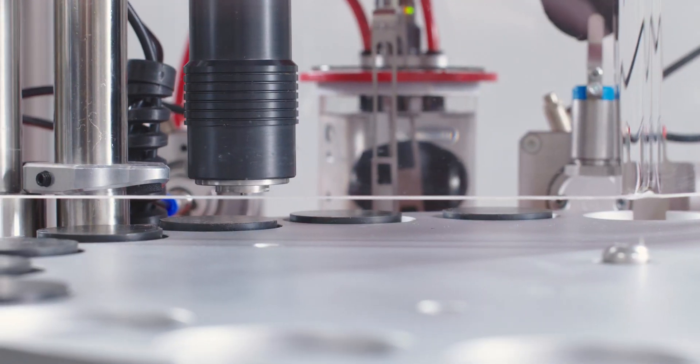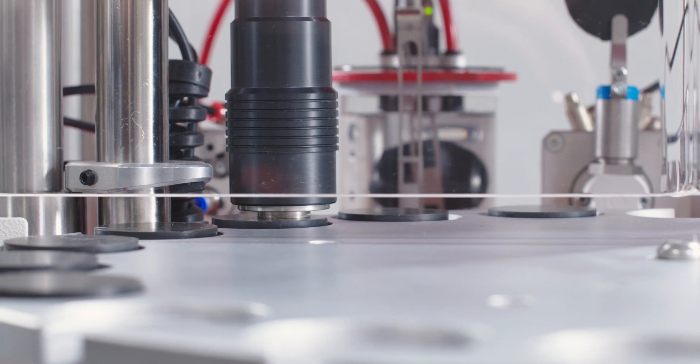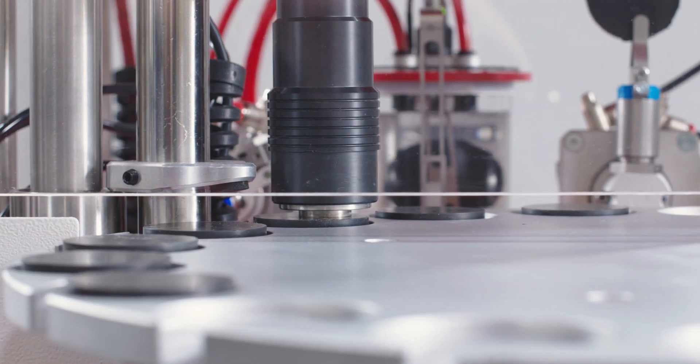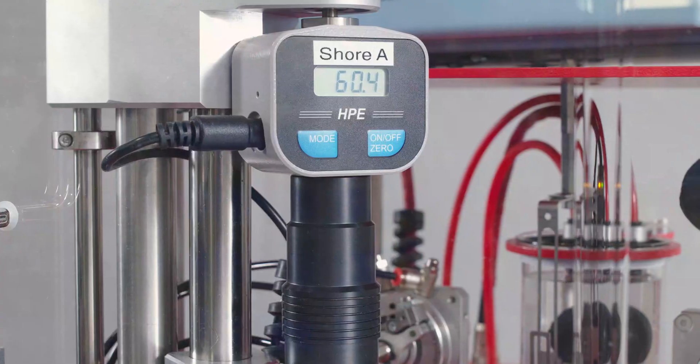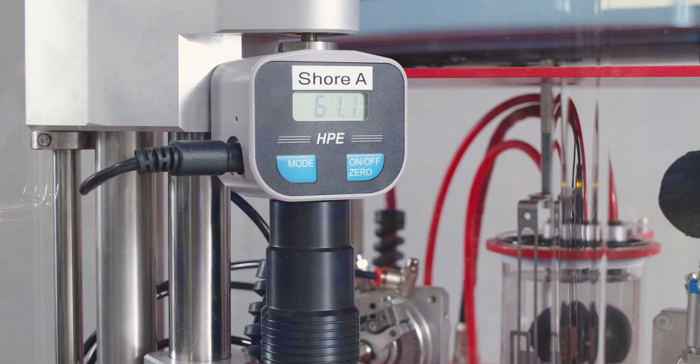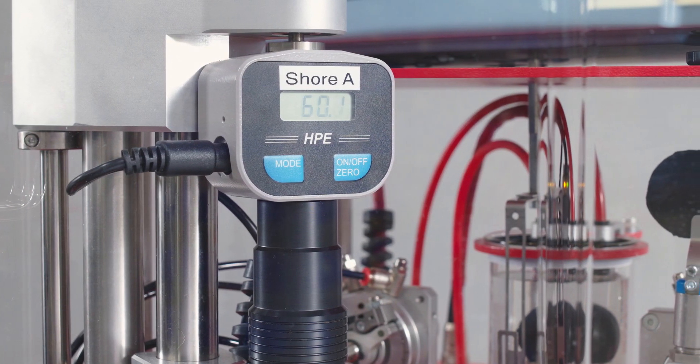For the first step in the sequence, hardness testing, the instrument's durometer head takes precise measurements on up to five points on the sample. Different indentation heads are available for various international standards, including Shore A, Shore D, and many more.